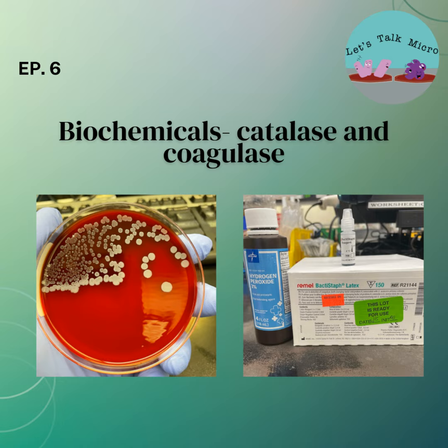But keep in mind that if you have white colonies in young females, like if you're on the urine bench, you need to do an ID to rule out Staph saprophyticus, which causes UTIs in young females. If you have beta hemolytic, coagulase negative, still do an ID to rule out Staph lugdunensis, because Staph lugdunensis is pathogenic.